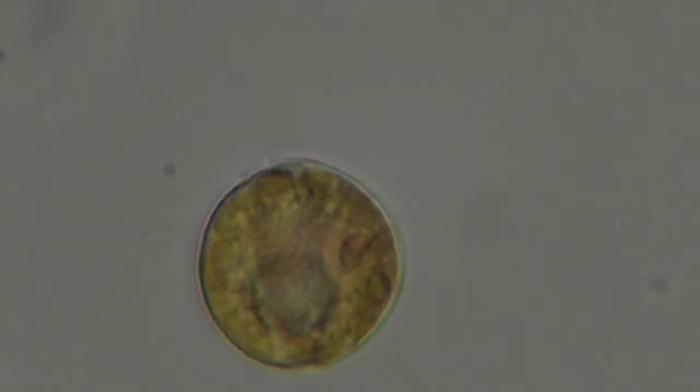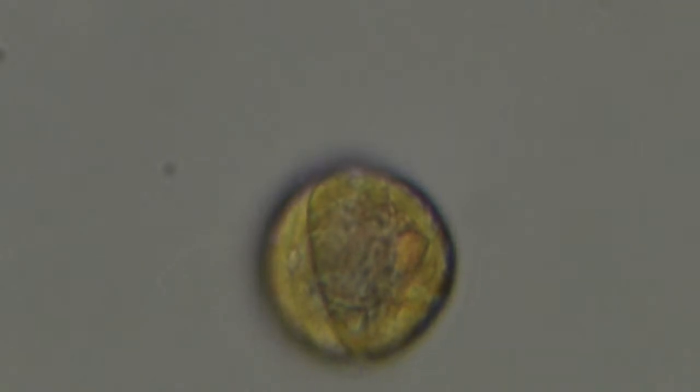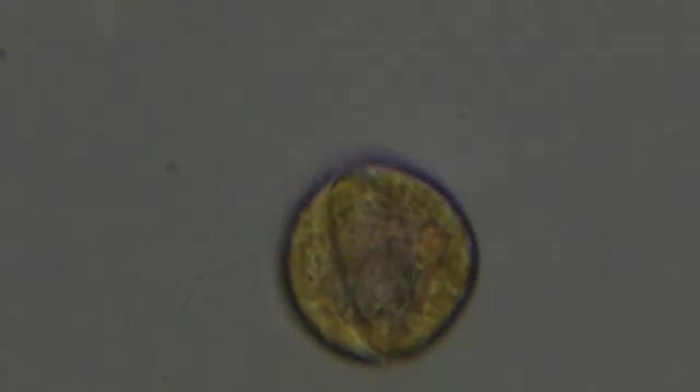Just do a little oil immersion on this guy. Hopefully it doesn't shift when I move it over. Sometimes, there we go. Now it's much closer. Now we're at 1,000 power. Now you can really get a better look at it. So if you look carefully, see how it rotates? Oh, now it's going to take off right when I'm getting a close view of it. Decides to leave. There we go. Nope, don't leave. Well, you got a little view of the waist.